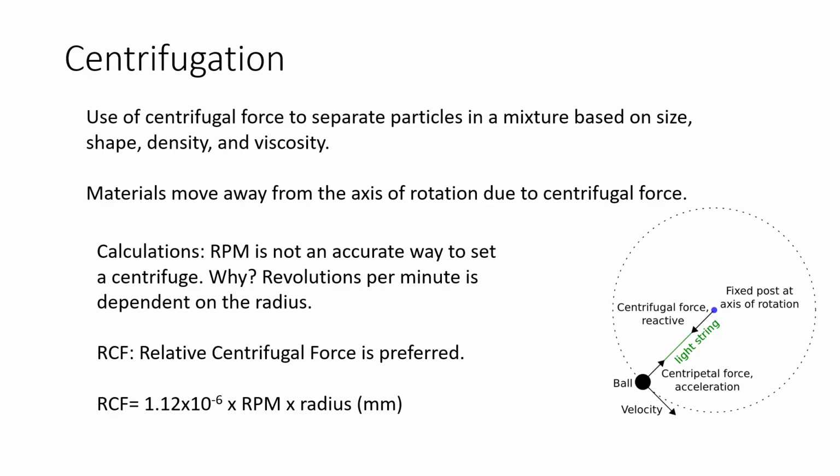Going back to the slide here: centrifugation is the use of centrifugal force to separate particles in a mixture based on size, shape, density, and viscosity. Materials move away from the axis of rotation due to centrifugal force. The difference between centrifugal and centripetal force is that centrifugal is moving away from the axis, while centripetal is moving toward the axis.